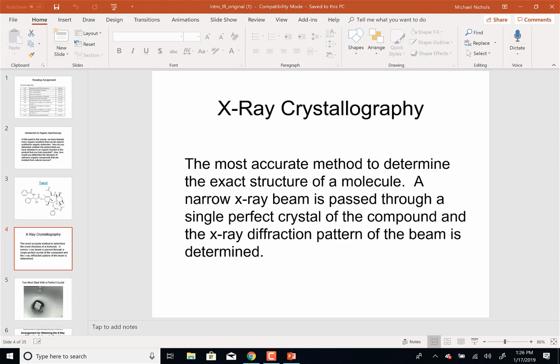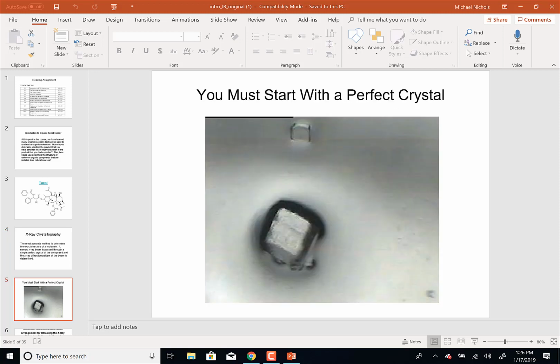So what happens in X-ray crystallography, just to give you an idea, is you have to grow a crystal. If that crystal at the top didn't have that small bite out of it in the corner, it would be perfect. Perfect shape, you can see through it. The one at the bottom I just don't think is in focus, but it's a little bit bigger. These are millimeter crystals. Okay.